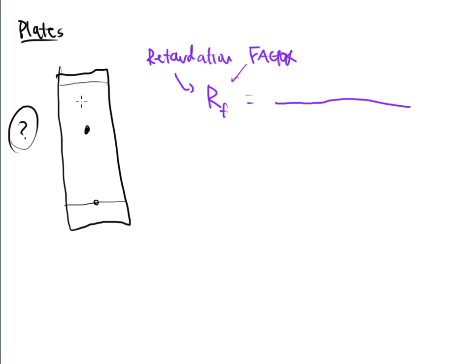Well, over here on the TLC plate, I'm basically going to literally take a ruler and I'm going to measure the distance from my starting origin to the mobile phase front. That is very important.